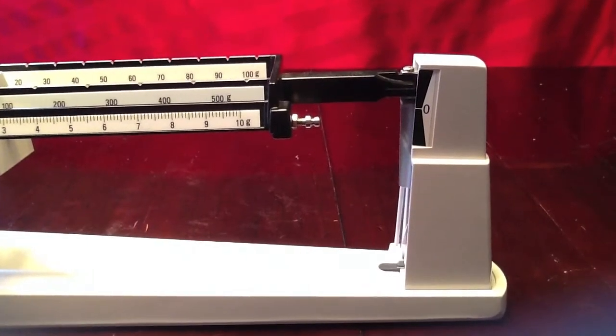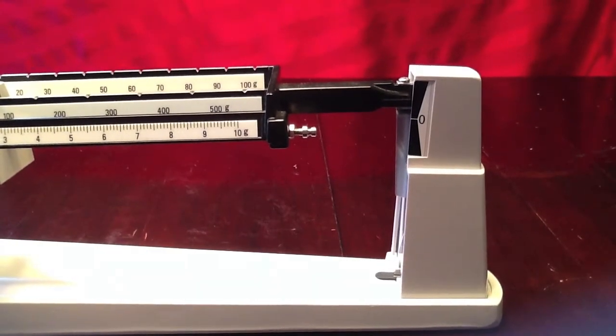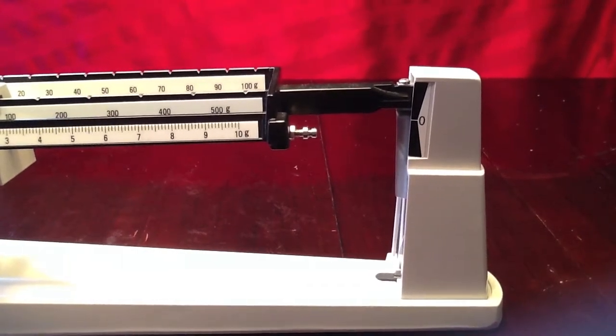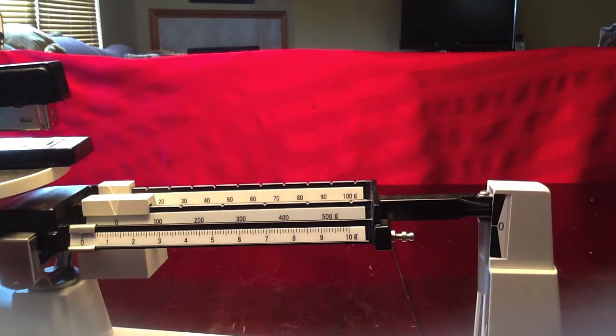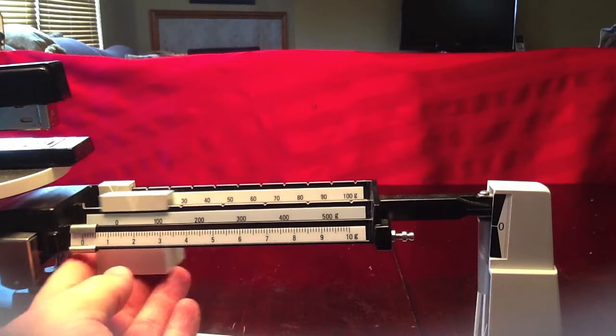With our stapler on the pan, we notice that our arrow is well above zero. So our first step is to move our 100 gram rider. We're going to move our 100 gram rider until our arrow falls below the zero.